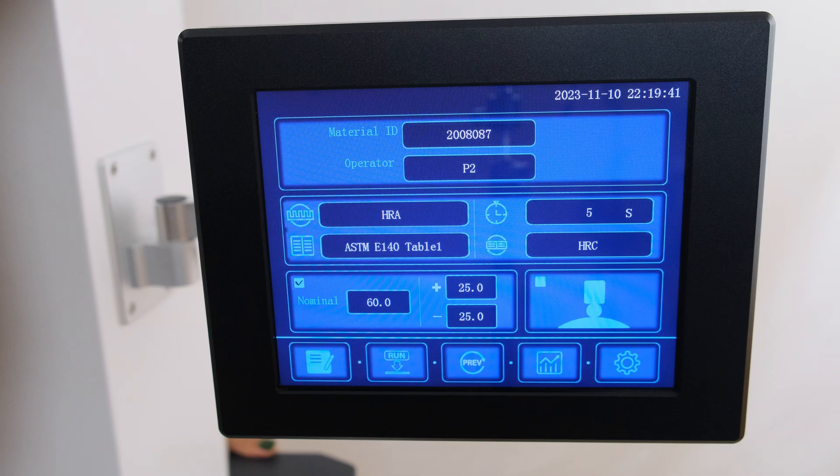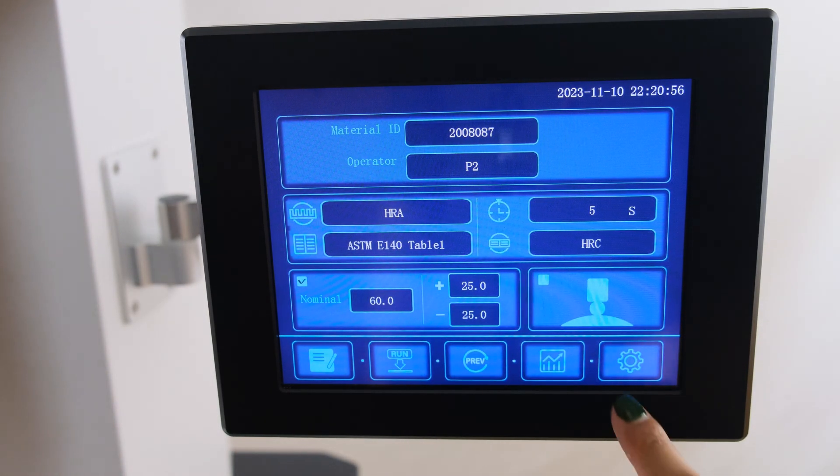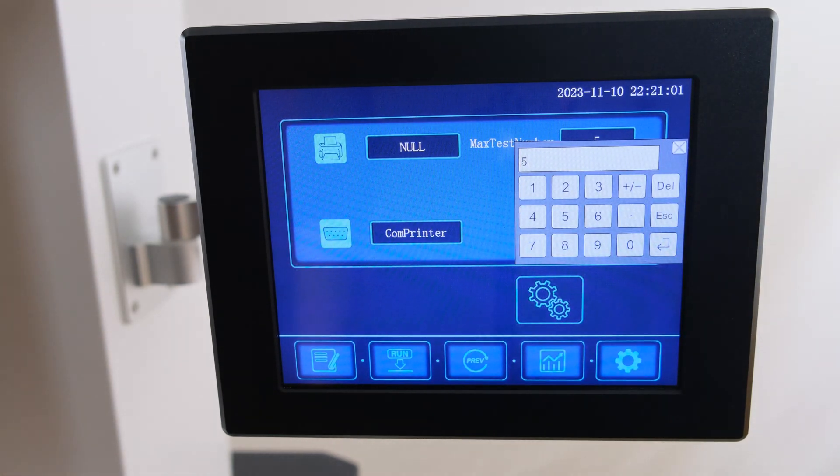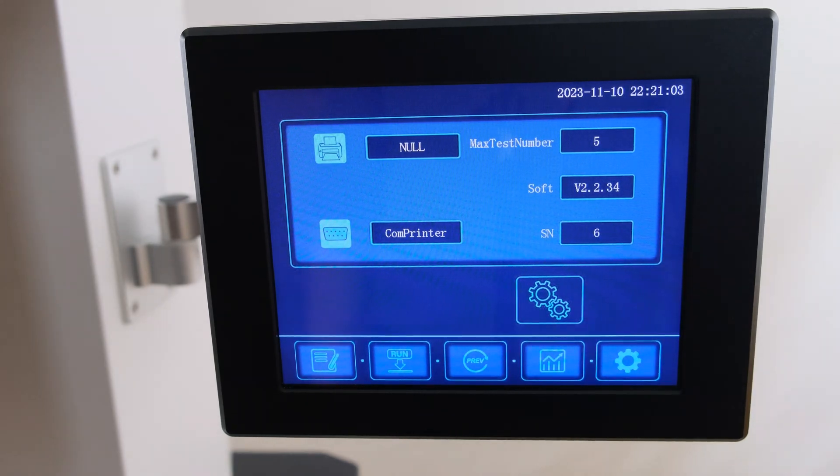After entering in your desired settings, it is recommended to press the fifth icon for device settings to set your maximum test number size. This number will determine the batch size for the autosave functionality of the machine.